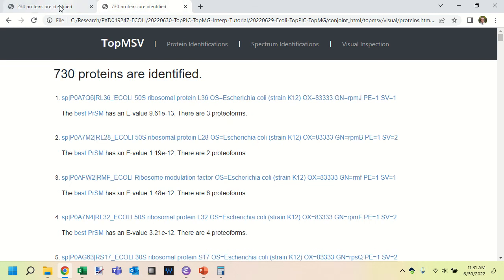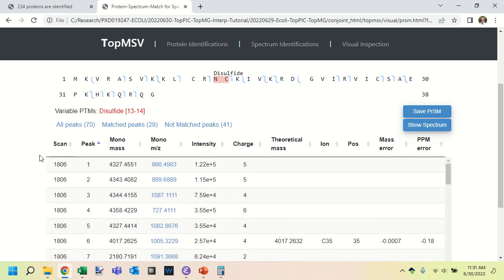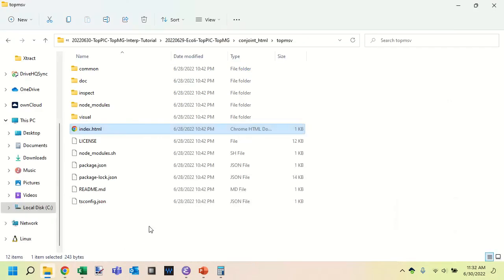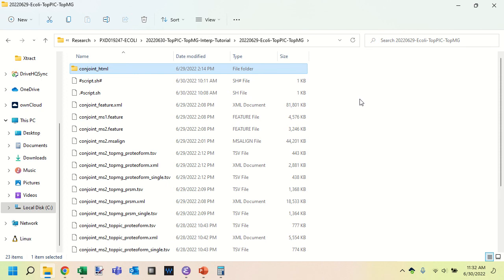Here we're not asking how many spectra are matched to a given accession, but rather how many proteoforms, how many distinct truncations of sequence and combinations of PTMs we've observed. All of that is possible within this interface, and hopefully the software makes it possible to jump directly to the best scoring of the proteoforms as well. So there's a lot of power in these reports.